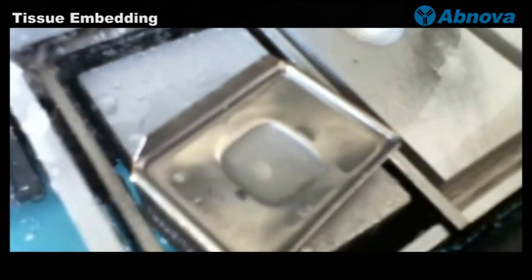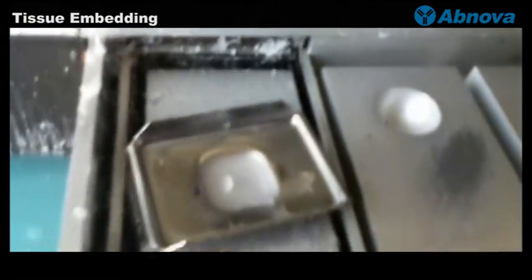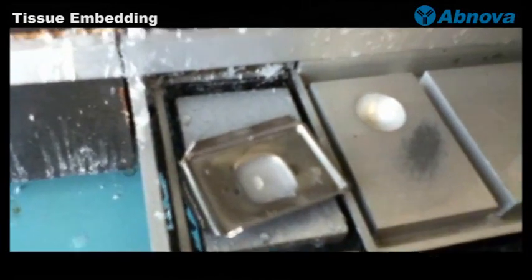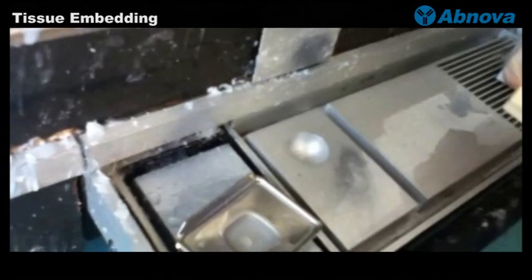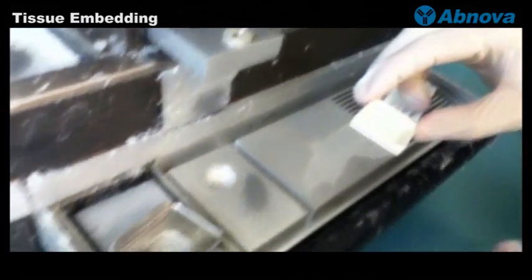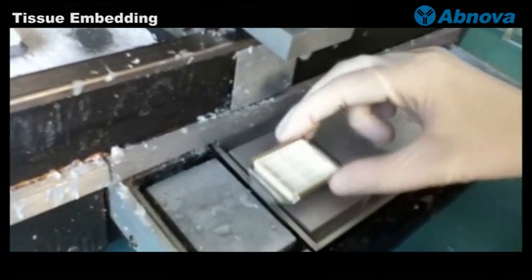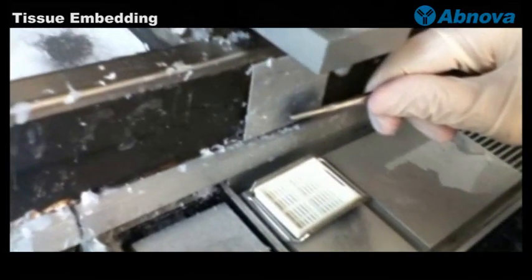The bone chip has been standing vertically and perpendicular to the block surface. You can take the whole metal mold to the dispenser and put the cassette tray on top, and dispense more paraffin on top to finish the whole block embedding process.